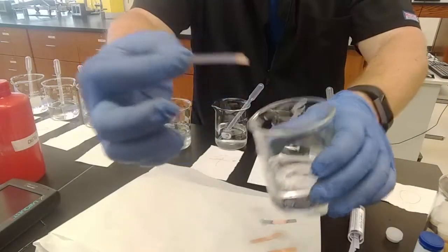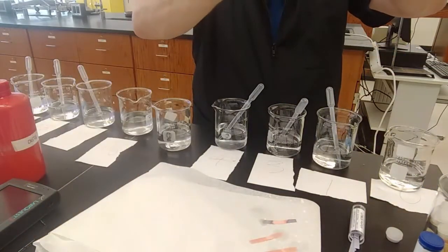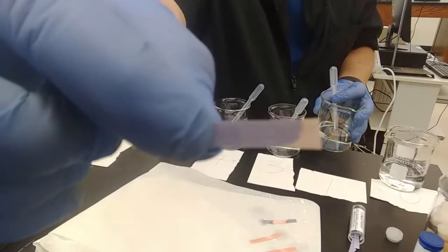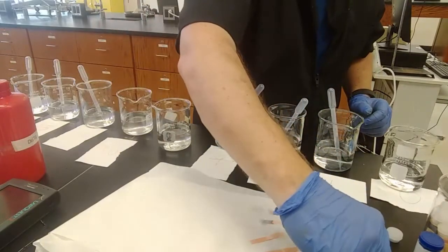Expected 0. Definitely turned red, as expected. Let's use the other end. Expected pH 1, we are expecting a change. Absolutely. Changes to red. So, 0 and 1 are acidic as expected.